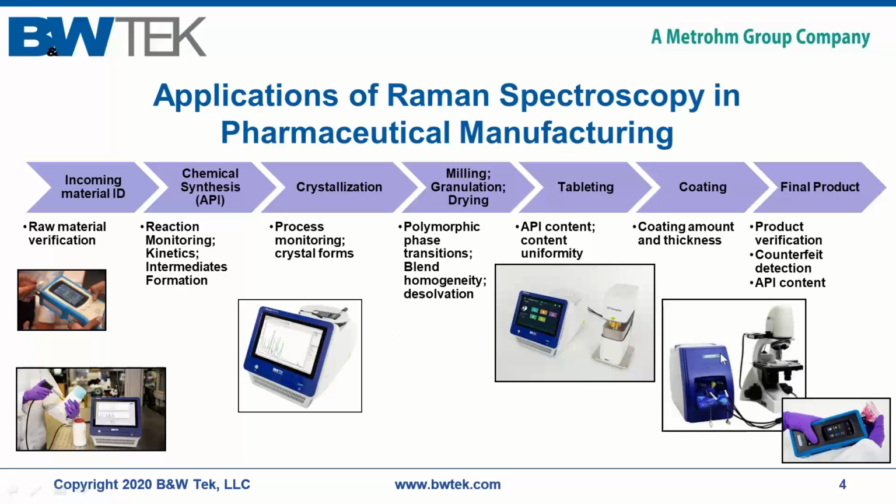That makes sense. Next question, asking for some information. Hopefully I get this right. Do you have any references from EP or USP for a customer who's using this for batch release? There is a publication on the use of Transmission Raman spectroscopy for that. So there are things in the open literature that exist. It has been done with Transmission Raman spectroscopy.